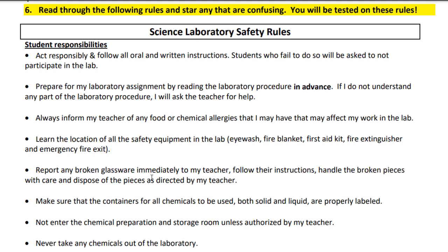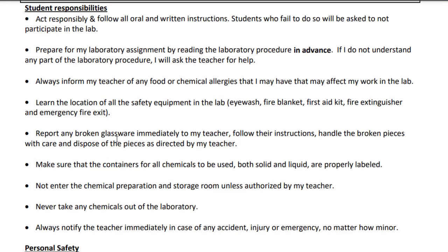Any glassware that gets broken, even if it's just a little chip, the type of glass that we use isn't safe to heat up if it's even slightly chipped. So make sure you let me know if there's anything that's broken, whether it's broken when you take it out of the cupboard or broken because of something that you guys did. Let me know. We'll clean it up properly and we'll put it away. And again, I'll show you where that proper place is and how to do that when we get back here in the building.